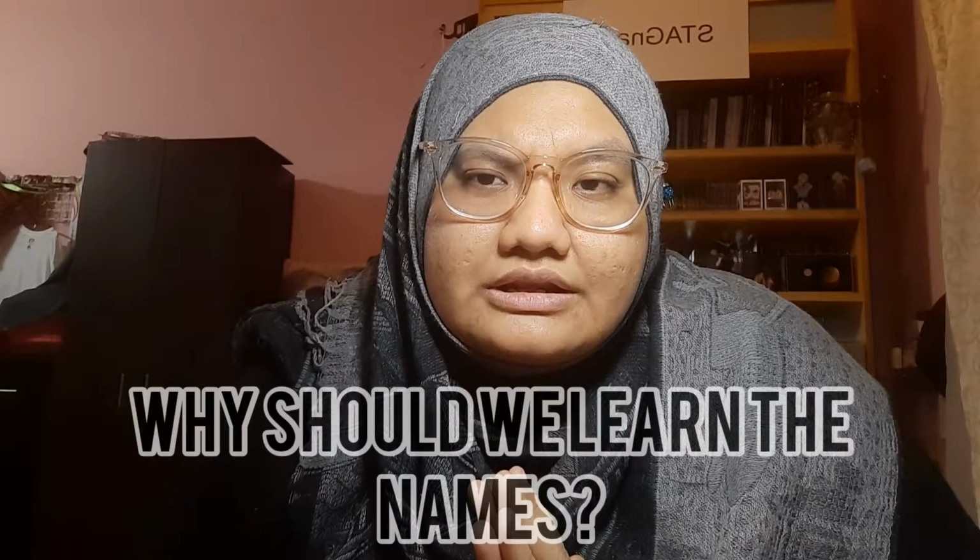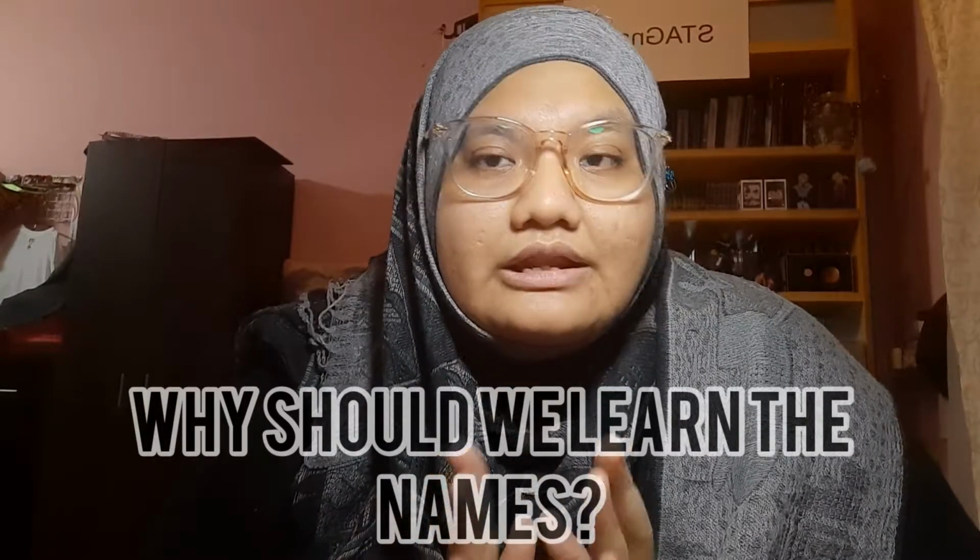Okay, some of you might think, why should we learn the names of the equipment and apparatus in the laboratory? Because some of them might be labeled, so it is just easier to take the equipment when you know the labels.